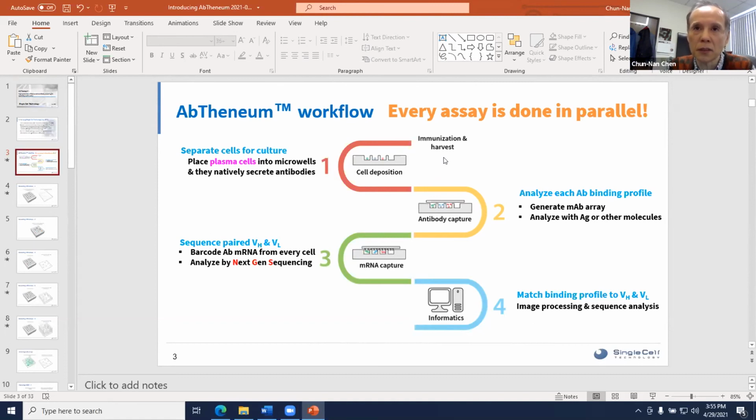And we don't know if it's simply the strain that we use, the adjuvant, or the immunization conditions. So it varies from sometimes 10% up to 80% of the cells that we put on. So even though we put down 25,000 cells, not all of the cells will be secreting that. So this is a really good question, and right now we don't have a good handle on that.